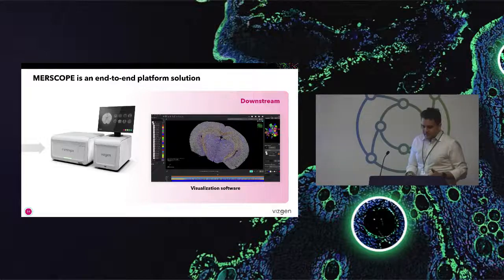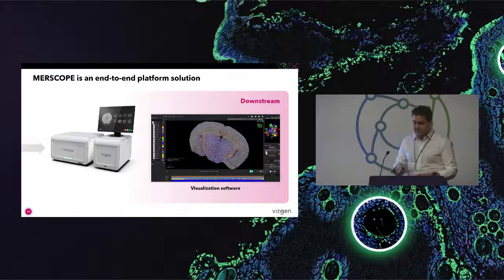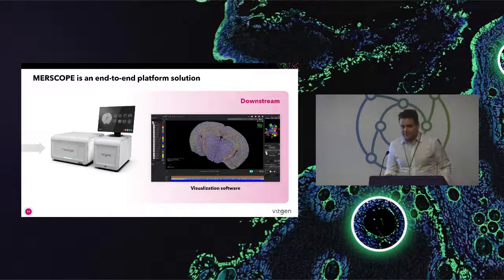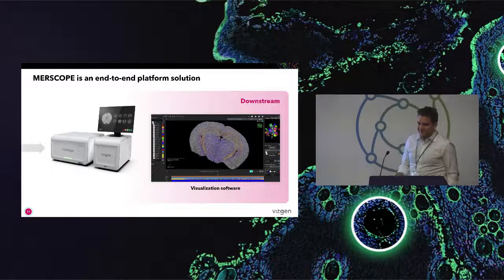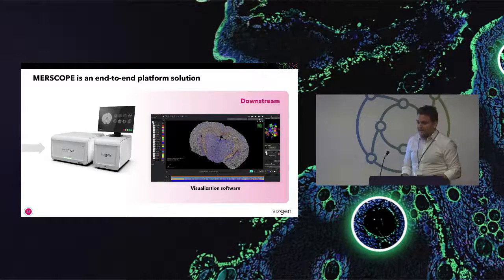In addition to that, we also perform cell segmentation so that you can immediately, out of the platform, do single cell analysis. We segment the boundary of each of the cells, and with that segmentation, we can then go back and count how many transcripts of each of the different genes fall within each of those cells, and in this way construct a cell-by-gene matrix. This cell-by-gene matrix is just like what you'd get from a single-cell sequencing experiment. It fits into the same sorts of tools, like Seurat or Scanpy, in order to cluster cells and identify different cell types across your sample. But now we have all the spatial information, so we can map those cell types back to their spatial coordinates.